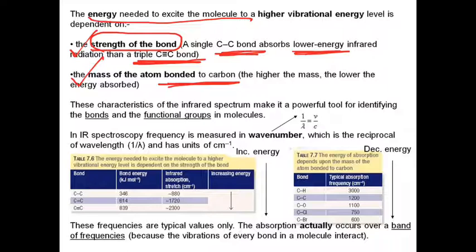These characteristics of the infrared spectrum make it a powerful tool for identifying the bonds and the functional groups in the molecules.